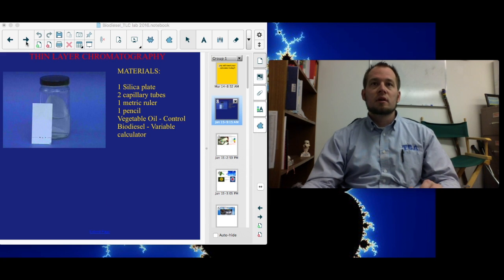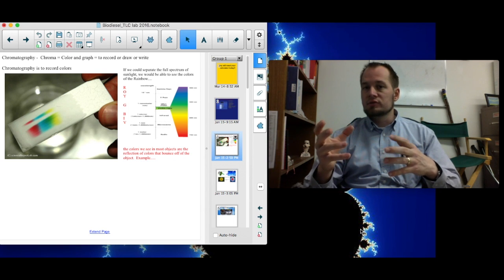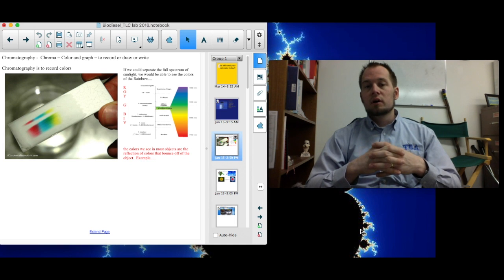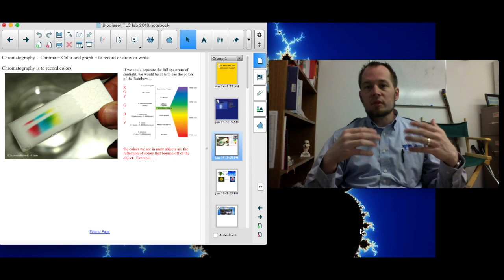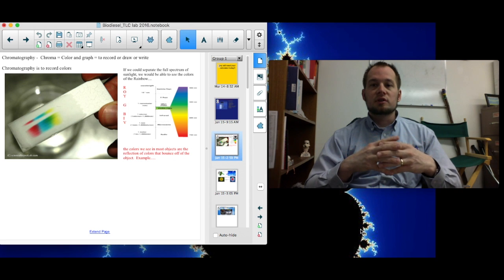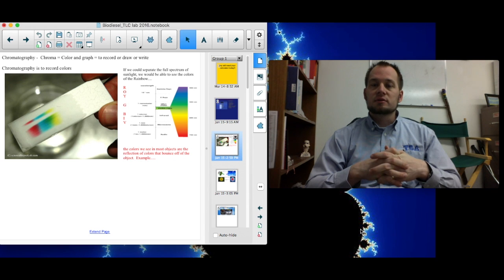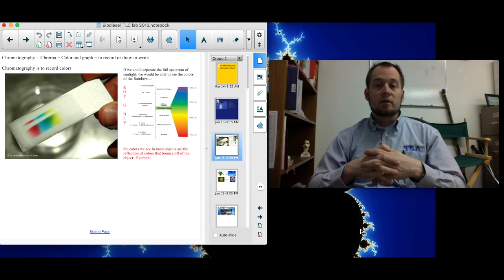What is chromatography? Chromatography comes from the two words chroma, of colors, and graph, which is writing. So the idea is that we're going to write or graph or view somehow the colors that might be present in a solution, in a mixture of some sort. A lot of times they got started by trying to separate out the colors in different kinds of ink or pigments in a substance, but it's used for lots and lots of other things now, which is kind of what we're doing with this biodiesel lab.